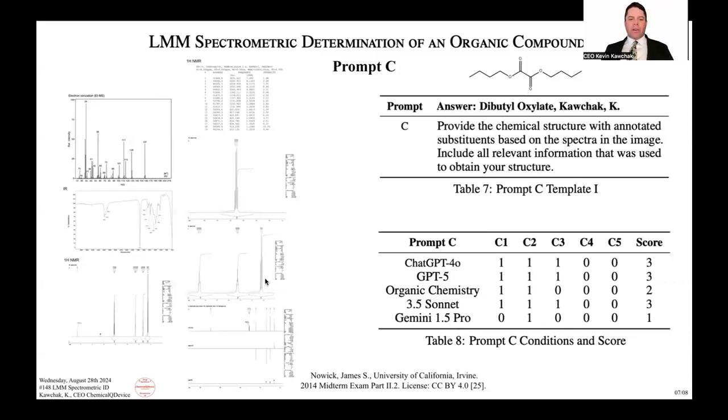Now, the other splitting patterns and their chemical shifts make sense. This one was just taken care of, the CH2 that I was talking about. And then you have the CH2, CH2, CH3, which are more typical. And again, they all integrate to 4, 4, 4, 6. And like I said, I've seen something like that in my previous journeys there.